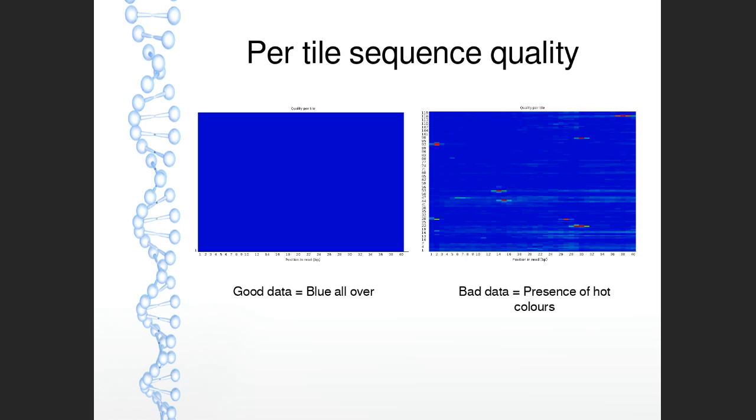So we might have a fluidics problem or an air bubble that was preventing the sequencing machine from reading good quality bases at that particular position within the tile. Now, when we go through our quality control step, once we go through our filtering and trimming process of our reads, we may find that these disappear as we trim away bad quality reads.